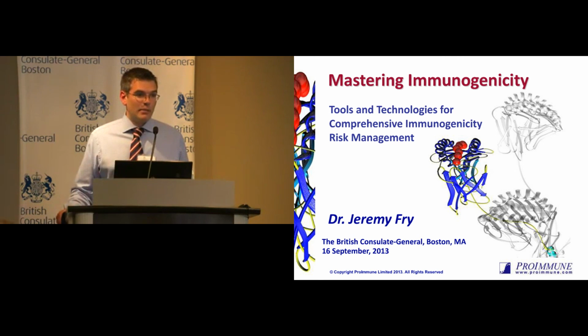We didn't have that ability, but certainly the stir stressing, we know from a point of view of visual inspection, gave a very cloudy appearance to the protein. And it was a bit of a last-minute addition to the experiment, but certainly very interesting with regards to the outcome. And it's something which I think Nick's going to be speaking a little bit more about tomorrow. Yeah, so it was a last-minute decision to say, can we just stir this overnight before we put it in the assay? So that's what we did at 700 RPM, I think, for 24 hours.